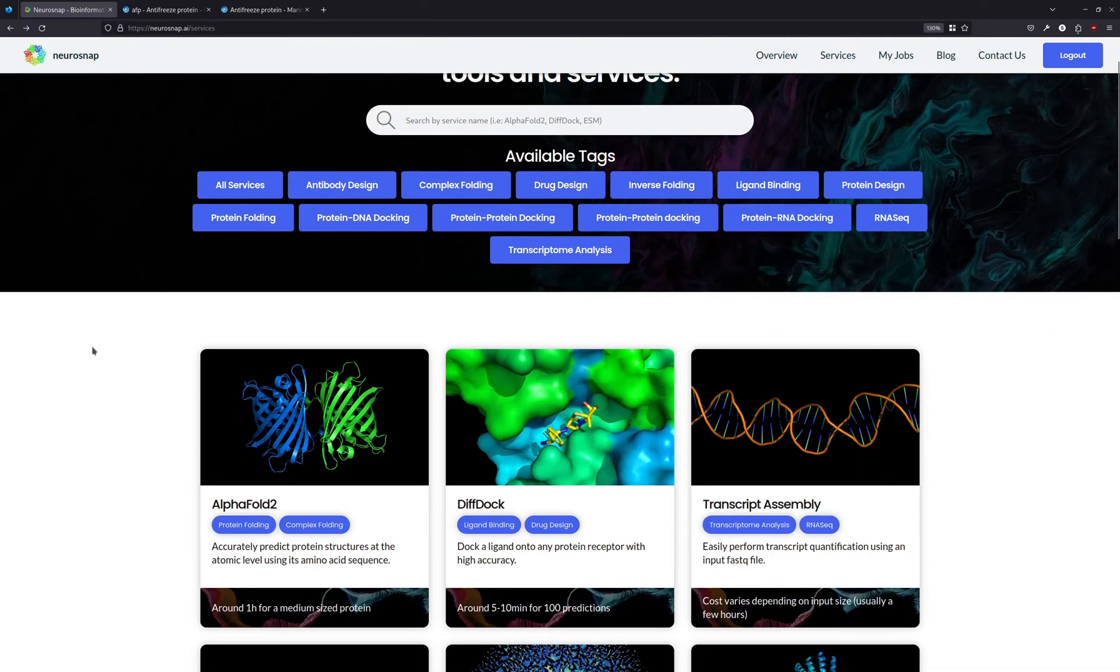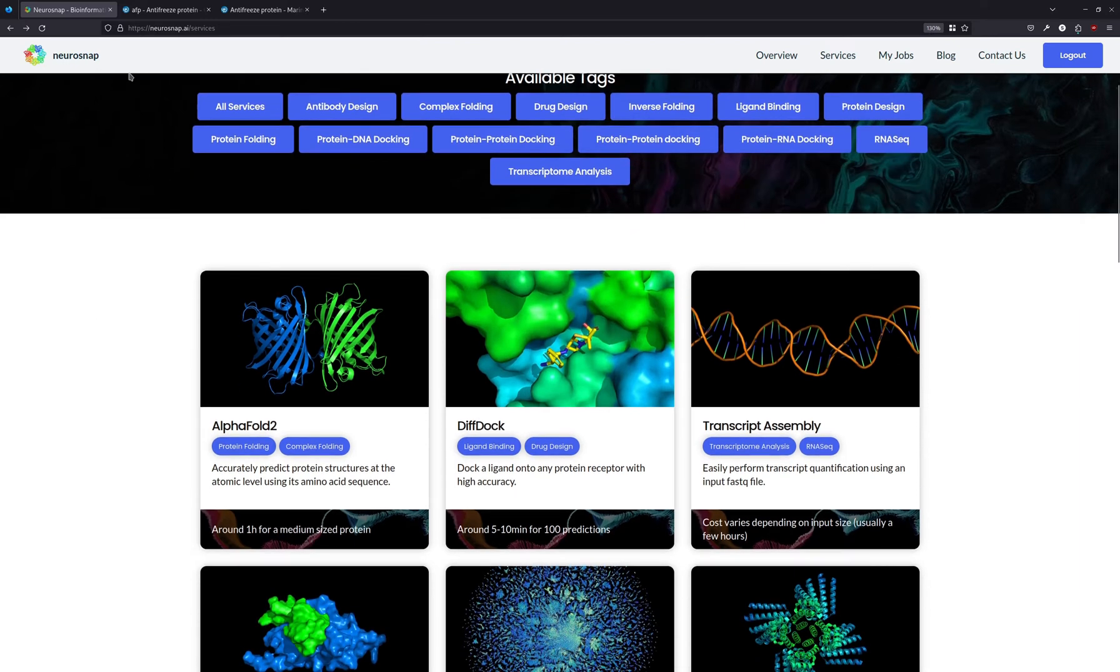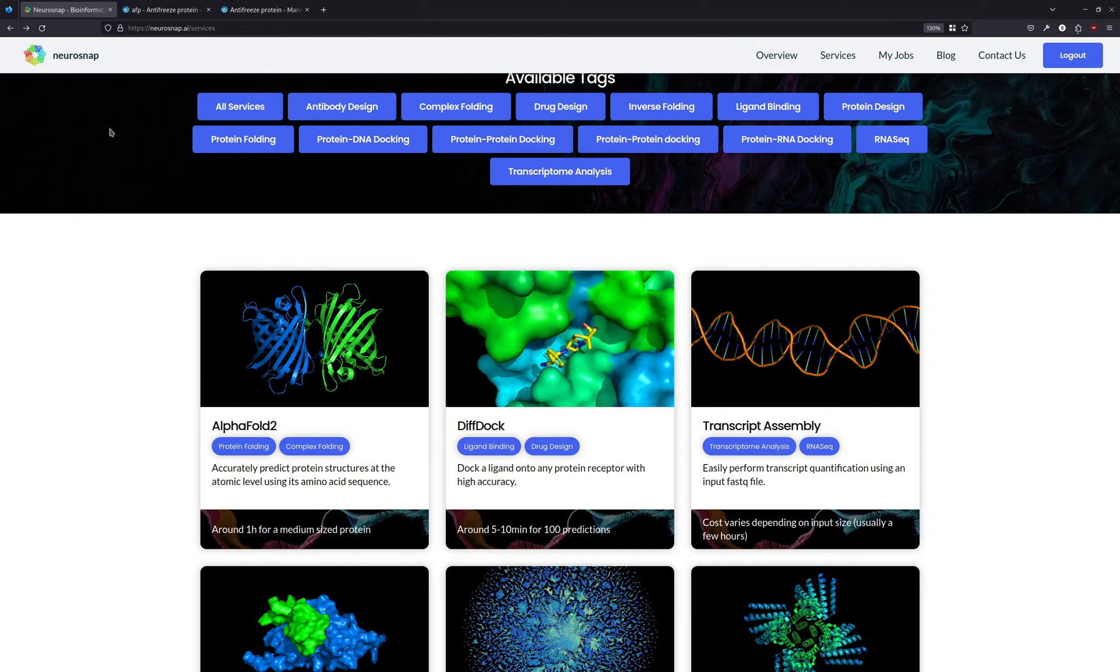So if you don't know, AlphaFold 2 is a protein structure prediction model by Google's DeepMind, and it's pretty accurate. Neurosnap, which is the platform we're going to be doing everything on, is where you can basically get access to deep learning models and different bioinformatic tools absolutely for free, and everything's run on their servers.